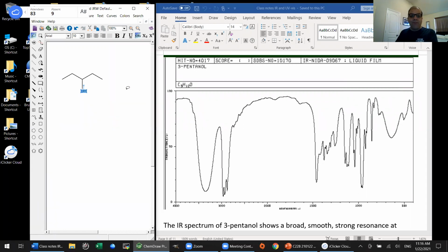The only time you don't see it is if basically the reason the peak has that shape, and again, to go to first principles on this would be beyond the scope of this course, but I can tell you that the direct cause of that particular shape is the hydrogen bonding that alcohols undergo.